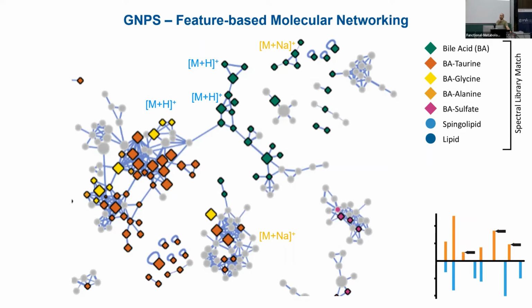Yeah. To this graph, is there any reason how they organize the nodes if they're not connected to each other? Is there any chemical nature behind it? So it's just white space and they put nodes somewhere. Yeah. So if there's no connection, we usually do it in Cytoscape. It's a very nice tool for the graphical visualization of networks and graphs. But it's usually just a force-directed graph. So if there's no edge between them, there's no force. So they're just going to disperse.